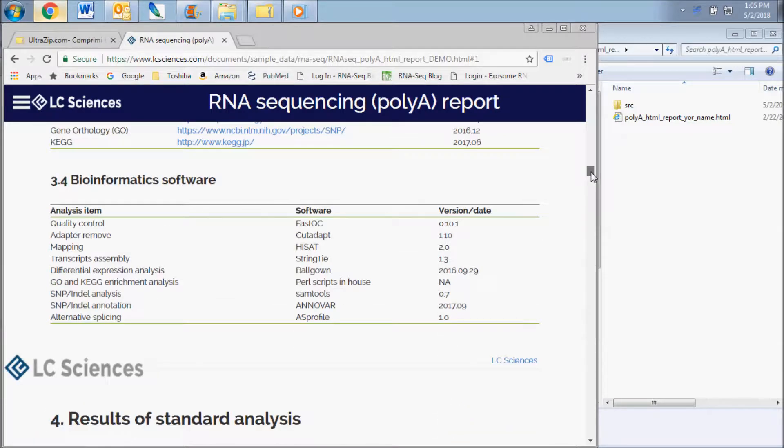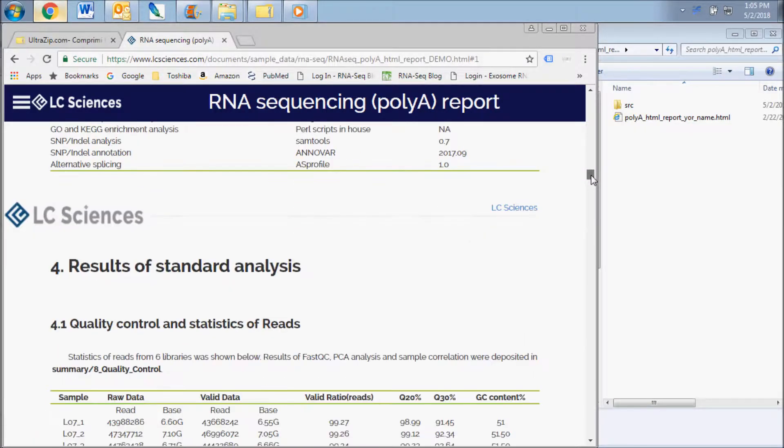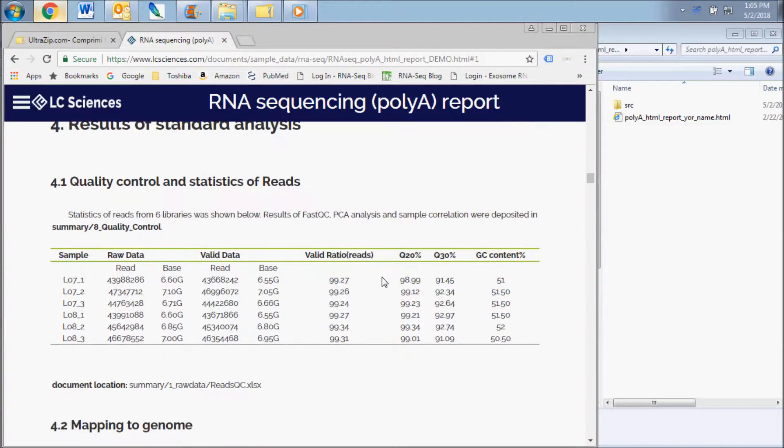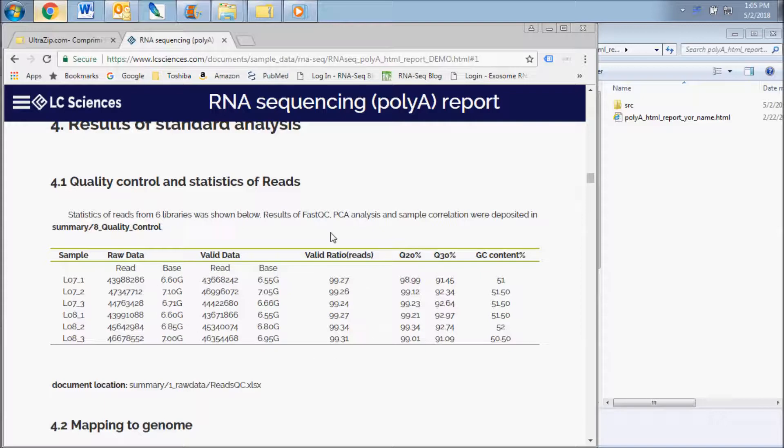This report contains some explanation of methods and results and enables you to view an abbreviated version of some of the tables and figures present in your dataset.